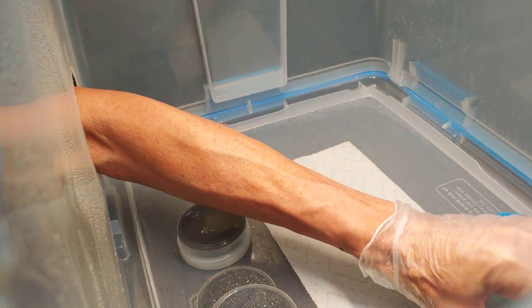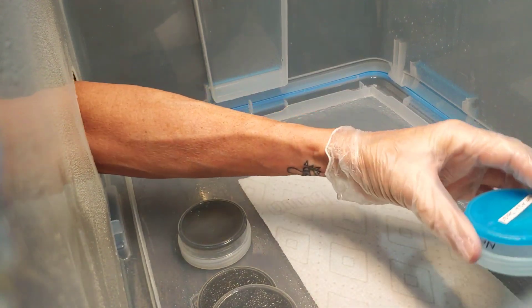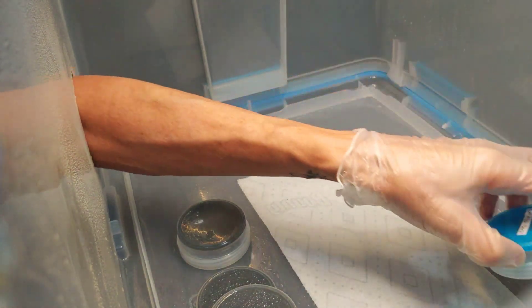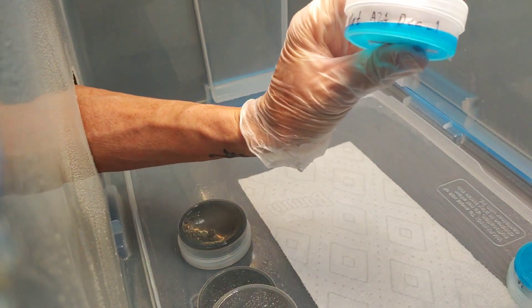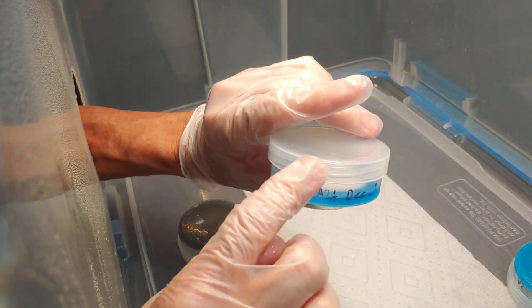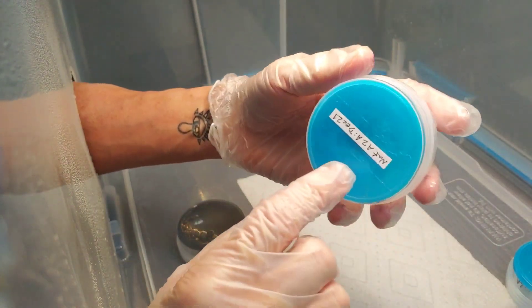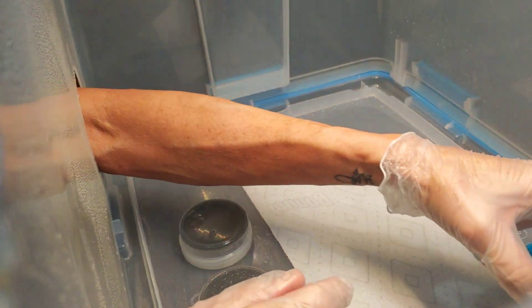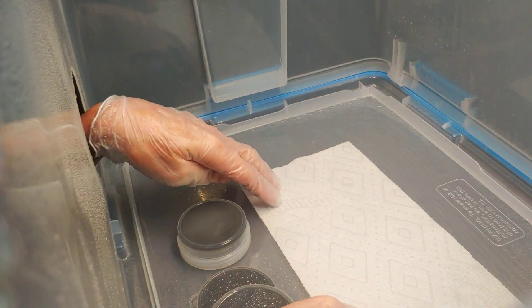I like to label them around the bottom because you don't touch it that much down there — you tend to touch it more up top. But if they're going to be long term, I like to also label them down here.